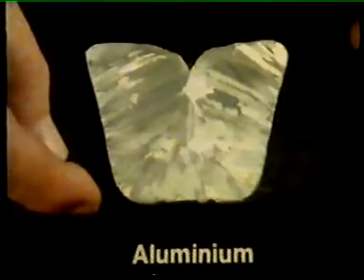One final wash, and there are the grains. Grains of pure aluminium. They're all similar, both in size and in structure. They appear as different shades only because of the way they reflect the light. By etching, we can reveal the grain structure of any metal.